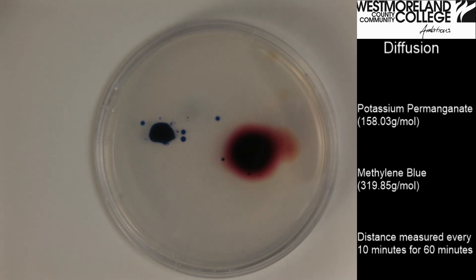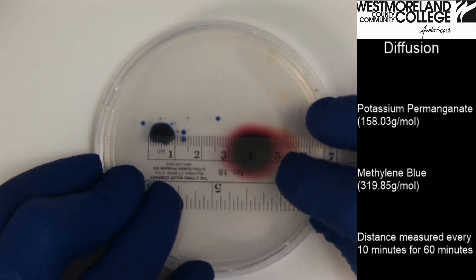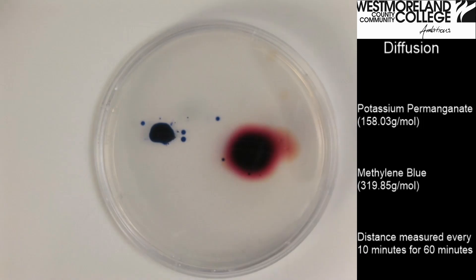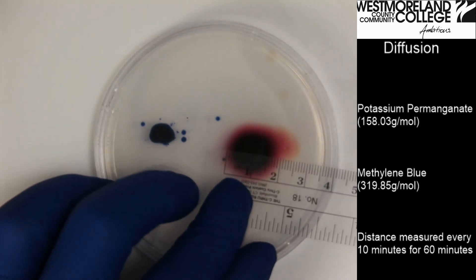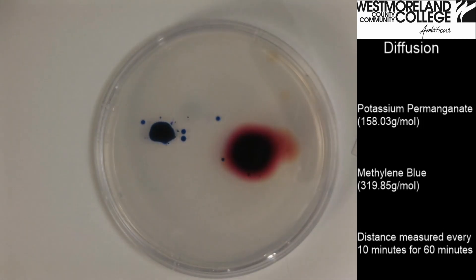It has been ten more minutes, and I will take another measurement. The methylene blue is still right around ten millimeters. The potassium permanganate still appears to be right around twenty millimeters. We will wait another ten minutes and then take a reading.